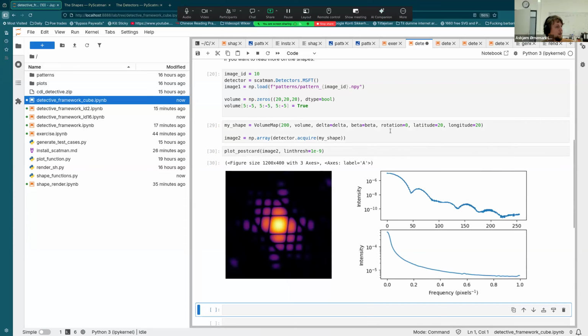Anyways, had you looked at this pill-shaped predefined thingy, wasn't it? Like this or a dumbbell? Yes, like a dumbbell. Since we were talking about this effect, is it possible to go from ellipsoidal towards dumbbell? Then eventually there should be a point where there's really a small cylindrical part.